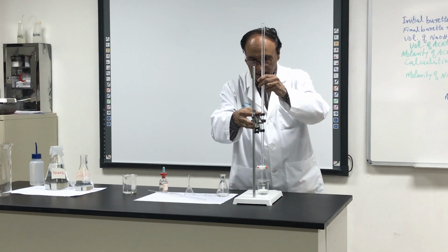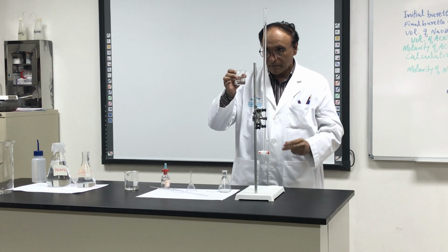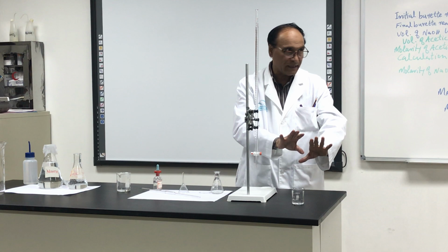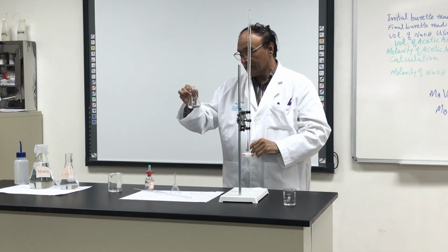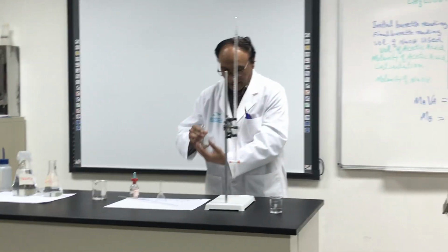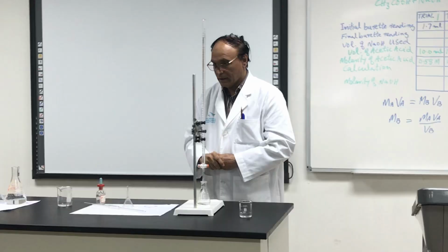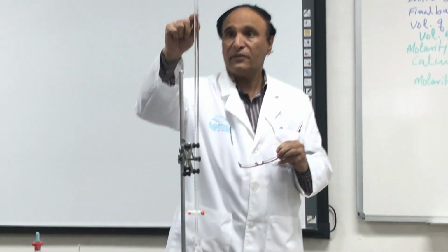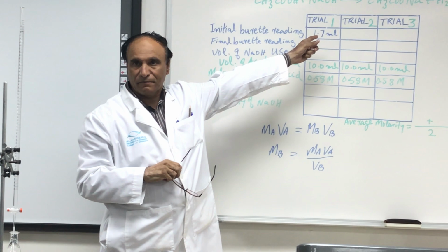And the other student has made this thing ready. And what is here in the small? Sodium hydroxide. Keep it on one side. Don't let it mix with something. And now here is the vinegar, acetic acid, and the indicator. And here I have everything ready. Now I have recorded the volume also. 1.7 milli. I have recorded the volume.